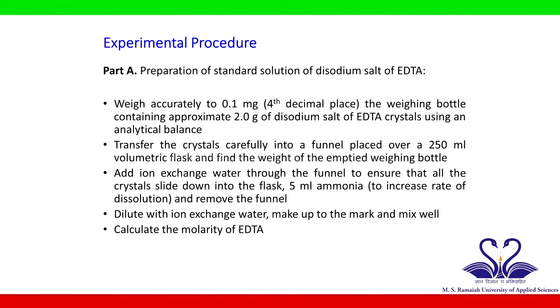Add ion exchange water through the funnel to ensure that all the EDTA crystals slide down into the flask. Now add 5 ml of ammonia to increase the rate of dissolution of the disodium salt of EDTA. Dilute with ion exchange water, make up to the mark and mix well. Finally, calculate the molarity of EDTA and transfer it into the burette.